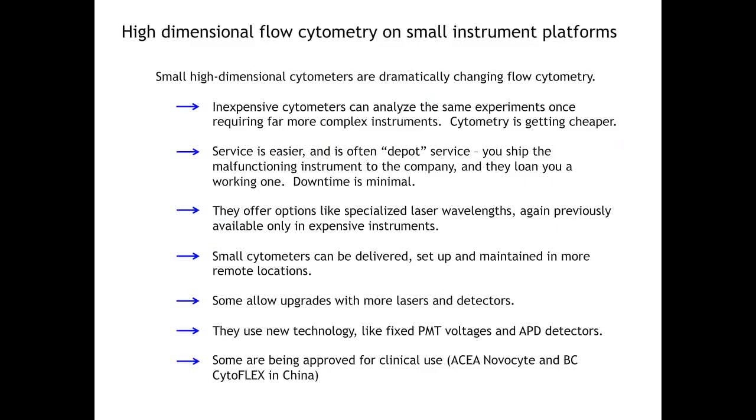So I think that small high-dimensional cytometers are dramatically changing flow cytometry. The cost has come down. Cytometry is becoming cheaper, but not necessarily with losing capability. We're able to do complex multi-color experiments using smaller, less expensive instrumentation.